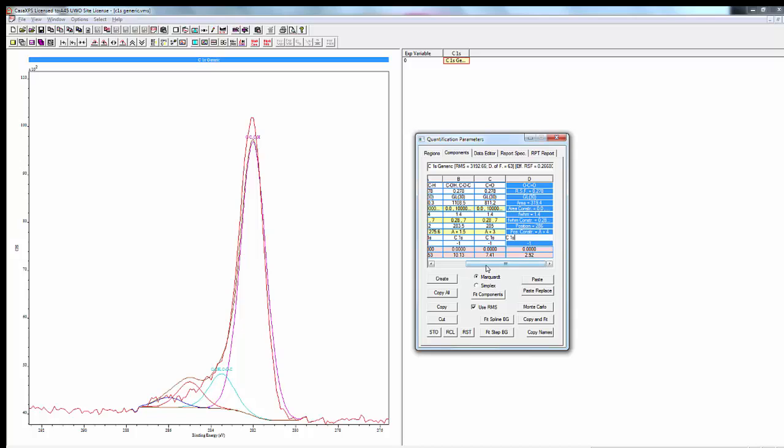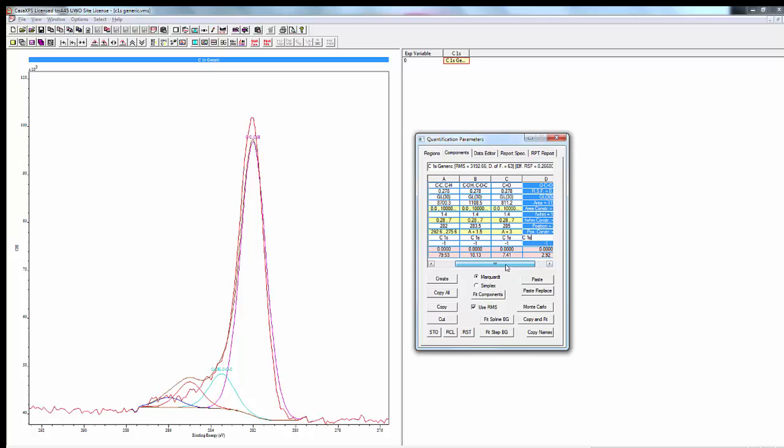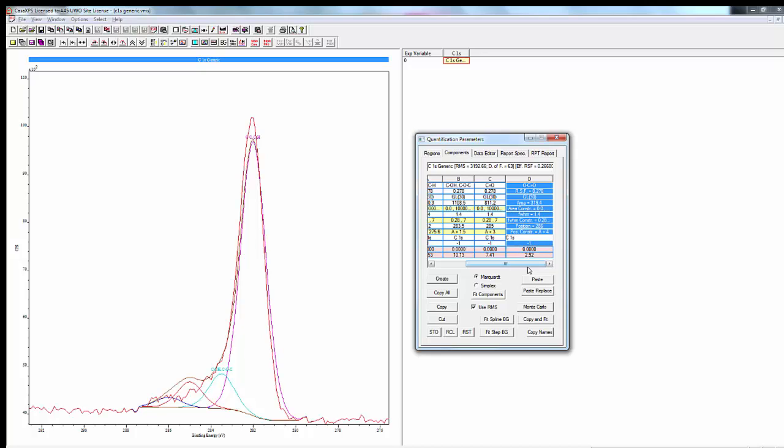Now these can range quite a bit. Alcohol functionality can range anywhere from plus 1.1 to 2 eV above the main peak, ketones 2.8 to 3 eV, and esters and acids could be 3.6 to 4.3 eV above the peak. But this is just a starting point, so you can change that later if you have the resolution within the spectrum to suggest that. You also should watch out for carbonates; they're going to be plus 4.5 or so above the main peak.